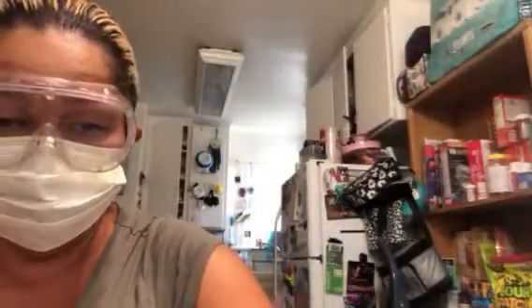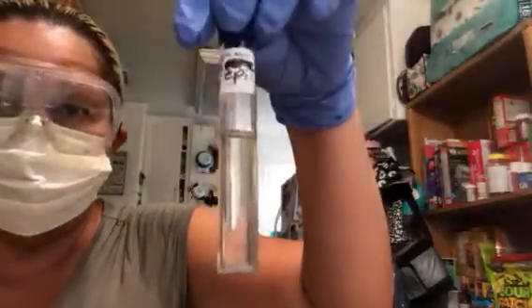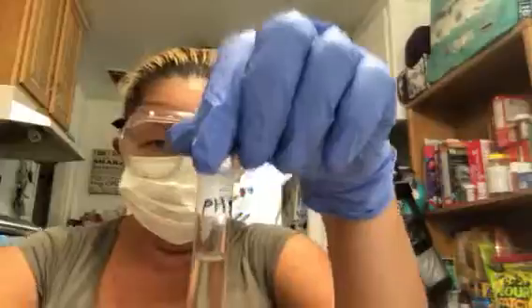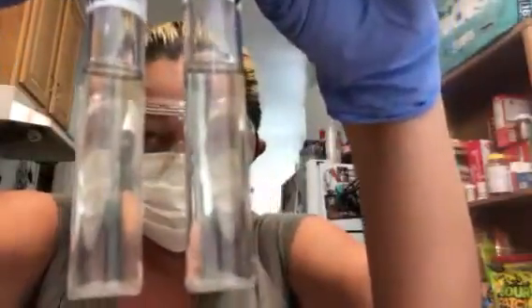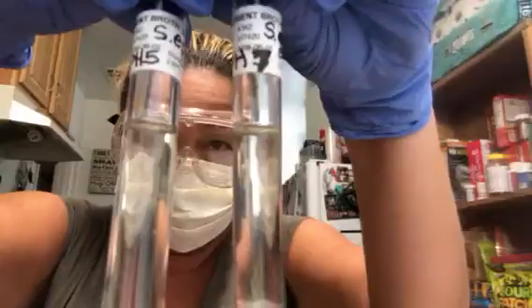So this is a pH 5 for S. epidermidis. Okay, this is pH 7 for S. epidermidis. And that's pretty clear. But when you put the other one up to it, there's a slight, very slight bit of turbidity in it. I don't know if you can see that. This is the 5 and this is the 7.